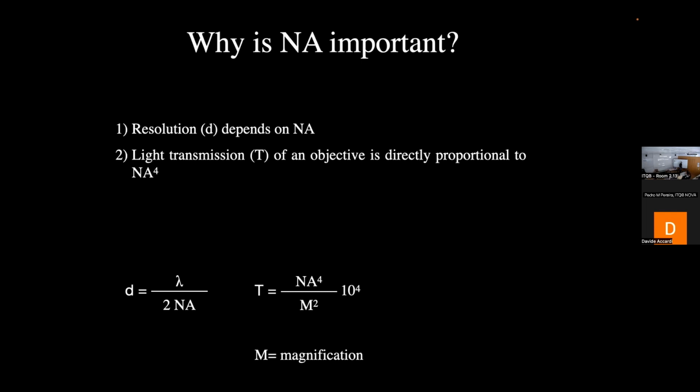The problem is that when you have single molecules, or fluorophores attached to single molecules, the amount of photons that they emit is extremely small. So a large numerical aperture will give you the possibility to see faint signal coming from single molecules, for example, or not at all. And you will have an enormous difference in observations, and you might see single mRNA molecules with, for example, a 20x 0.8 lens. This is already a big difference. Let's say a 1.4 lens and a 10x 0.45 lens.